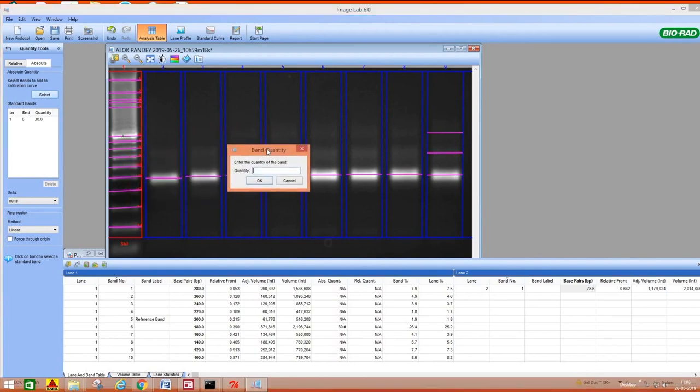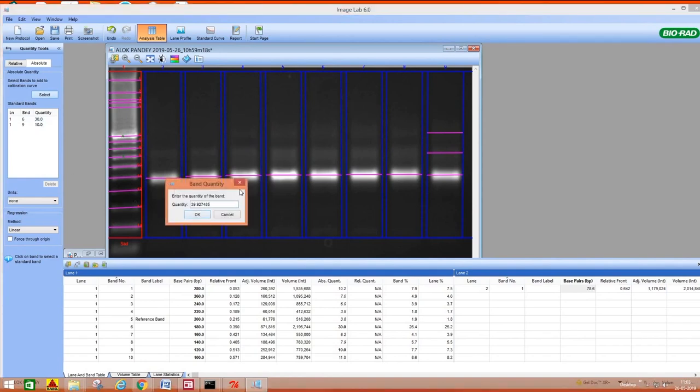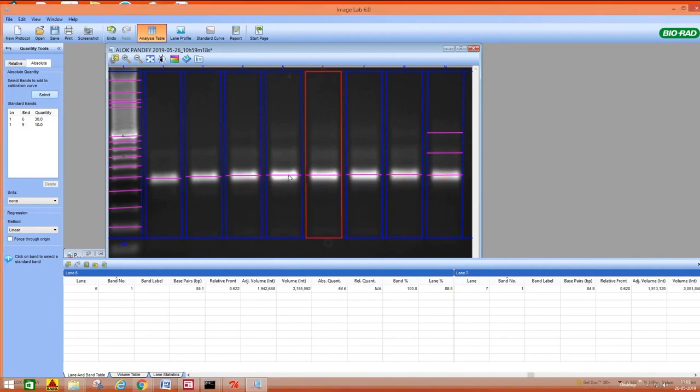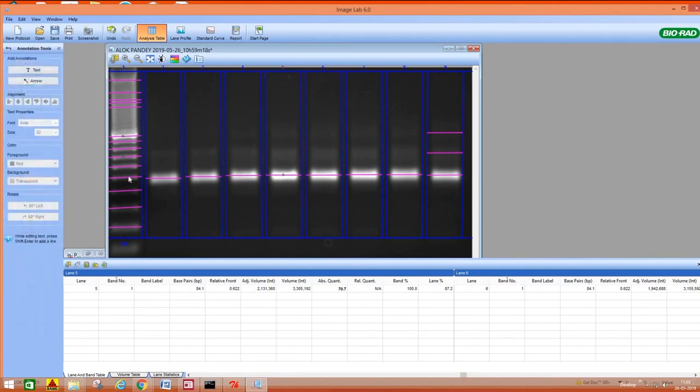So another band, at least we need two. This is 10 nanogram. After giving two values, you can click any band. Suppose this one 39.92, this one 55, and this one 63, this one 64. So in this way you can calculate the intensity or absolute quantity of any given band.